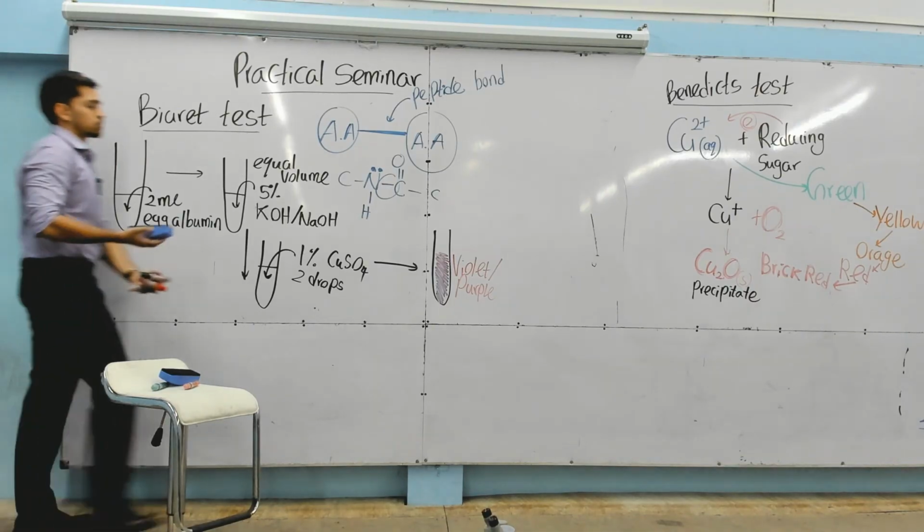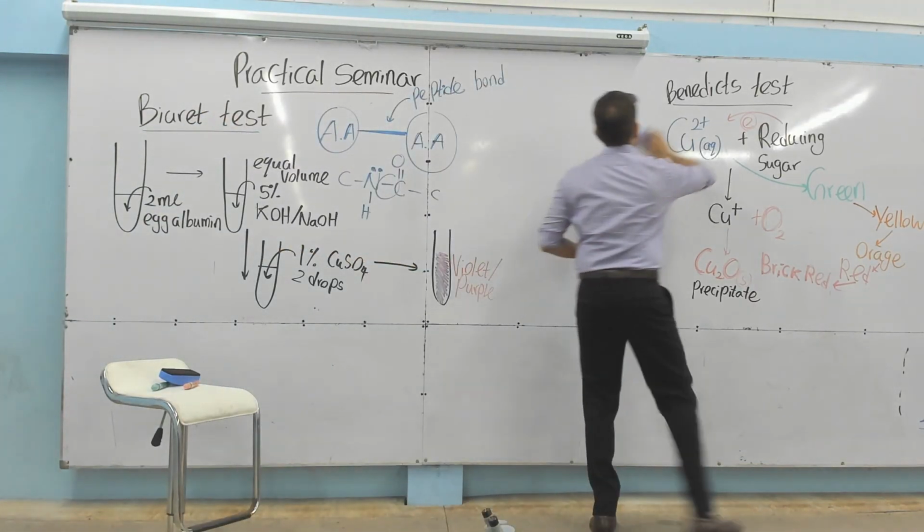So Benedict's is all done now, so I'll erase this side. Okay.